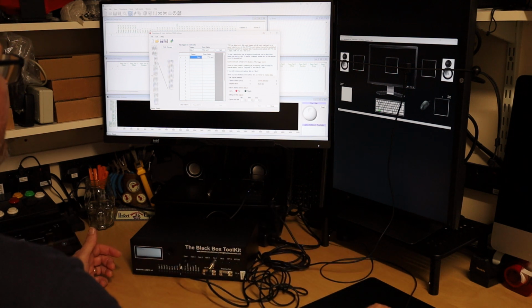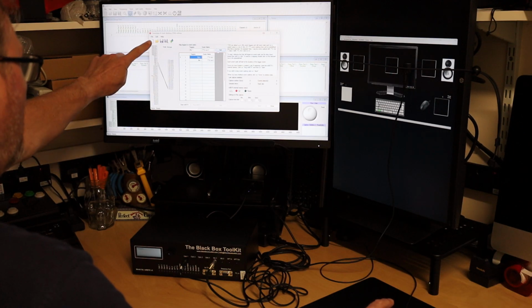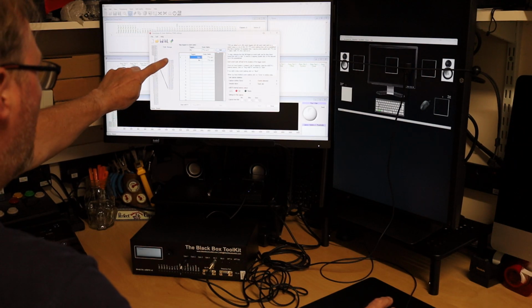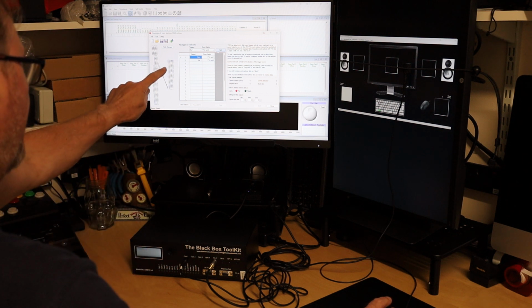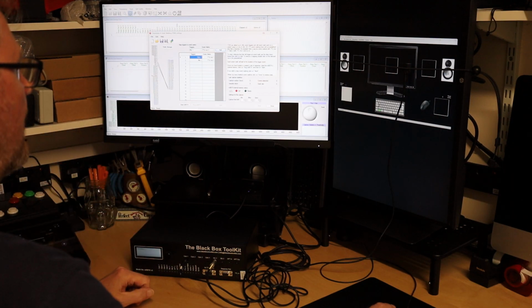Now we can say, okay, if I hear something on microphone 1, we'll event mark on TTL out 2. So you can see we're gradually building up a visual representation of what the inputs are, so what inputs we get in the real world and what we map them out to as an event mark. Yep, so we've got the triggers and the event marks, and they're basically 5-volt signals that are high whilst we get the input we're looking for. And we can run that for, we'll just run that for 30 seconds in this example.